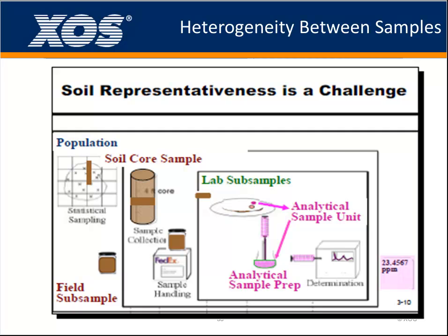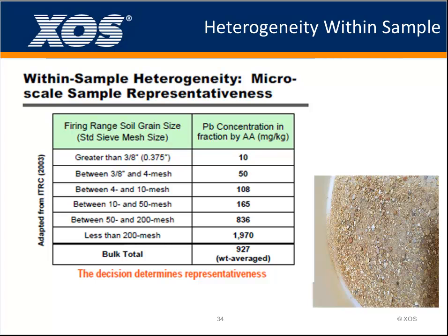So we need to use very strict process of the 500 samples. But actually, in many laboratories, they are not doing this strictly quite well because it costs them much higher labor cost and time cost. But for HDXRF, with XRF technology, it can analyze much larger area and much larger quantity of the sample so that it can have better representativeness.